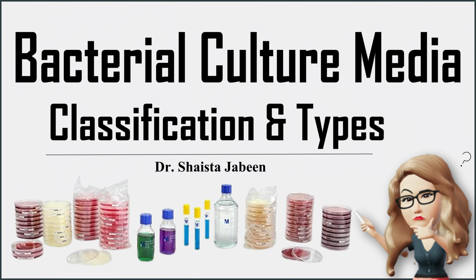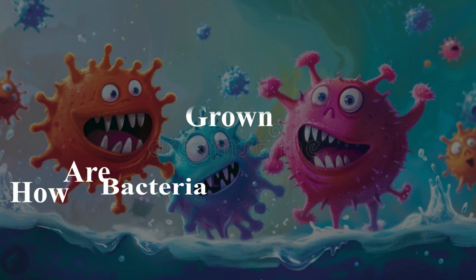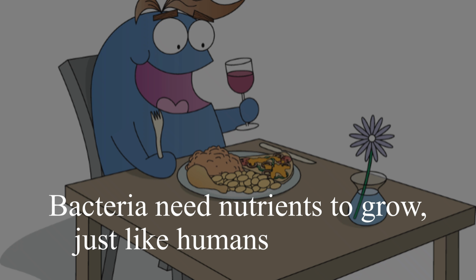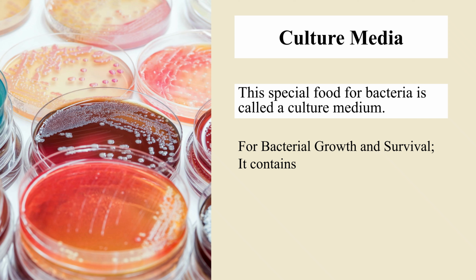Hi everyone, let's learn about bacterial culture media. How the bacteria are grown in the labs. Just like humans need food, bacteria also need nutrients for their growth and nourishment. The special food which is required for bacterial growth and survival is known as culture medium.